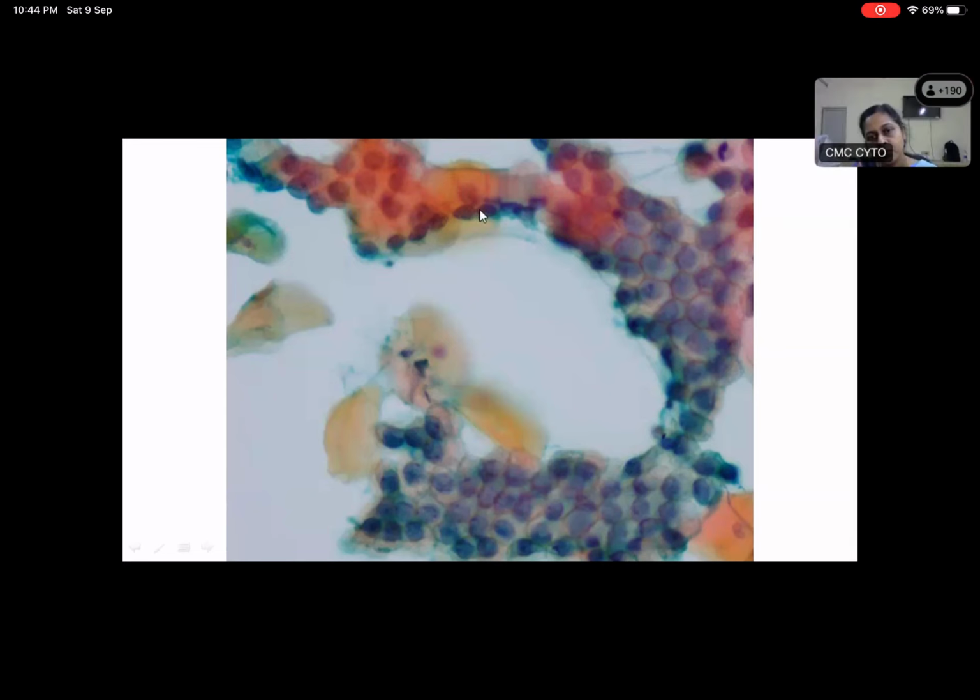Why is the nucleus pushed to the bottom? What kind of cells are endocervical cells to begin with? Columnar. Columnar cells, very good. So columnar cells have got, what is this thing? Cilium. Terminal plate, tuft of cilia from the terminal plate. And intracytoplasmic, mucin. Mucin, yes, very good. So that is the mucin which is present there.